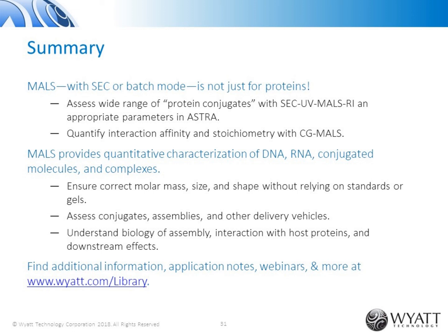Adding a size measurement like a DLS or an online viscometry would give us additional information about the hydrodynamic size, and so we could draw some conclusions about the conformation, if it is compact and globular or if it's more elongated. But the conformation doesn't impact how we do the analysis.